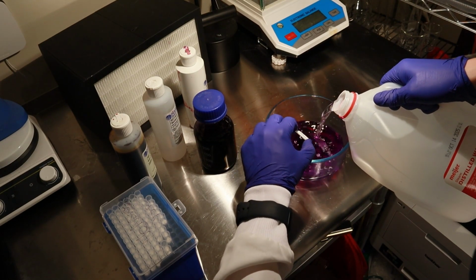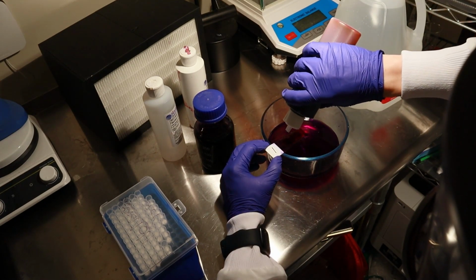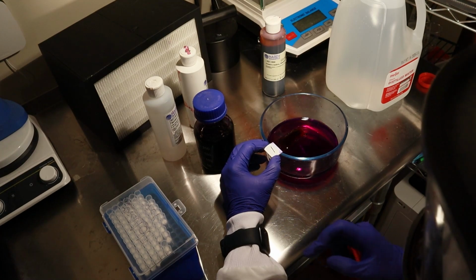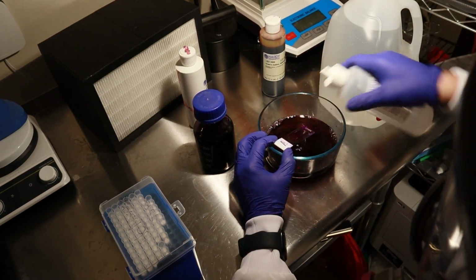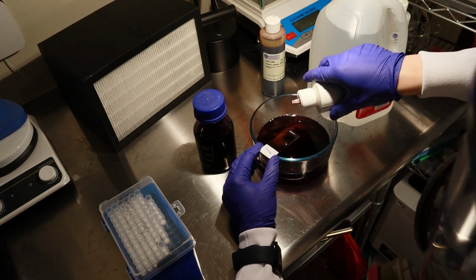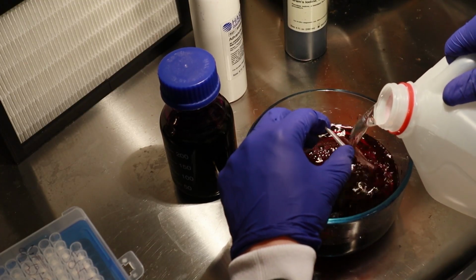After 1 minute, I took a jug of distilled water and rinsed the slide. Then I put on a few drops of Gram's iodine, setting another 1-minute timer. Following that, with another rinse, and then very quickly, I added the decolorizer and immediately rinsed it again. And then finally, I added a few drops of counterstain, and after 1 more minute and another rinse, I left the slide to dry.